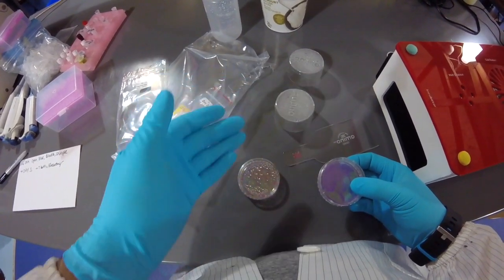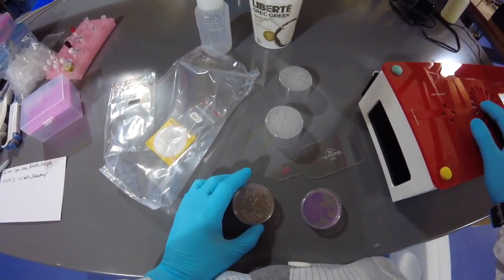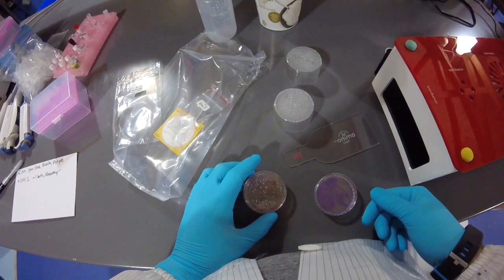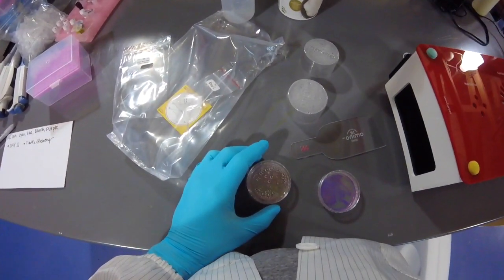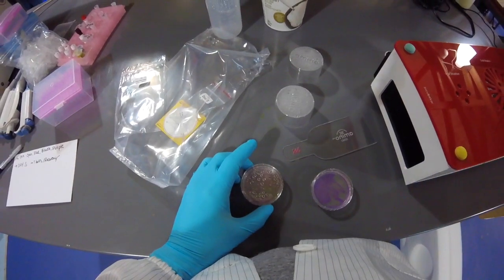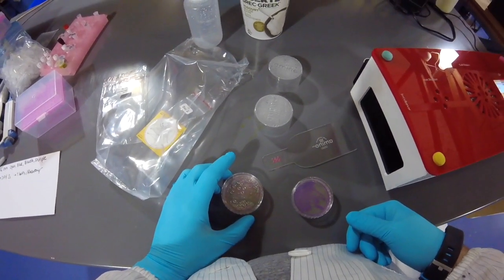And then we collected some colonies from that blank cell plate, and we mixed them into a transformation buffer on cold, again, the cold to help protect the cells. Then we added some DNA and left those for about 5 minutes. Then we did a heat shock where we warmed up the cells so the DNA could start getting into the cells, and then we cooled it down so that we could trap the DNA in. Then we added recovery media so the cells could start growing and dividing again, and we incubated that overnight at 37.